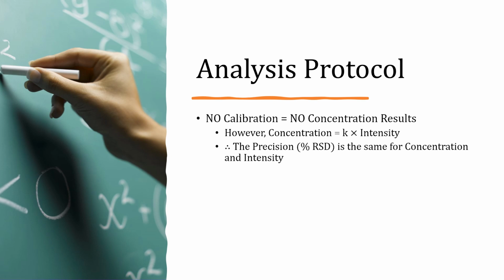So remember that there was no calibration and thus no concentration results. However, the concentration is always a constant multiplied by the intensity. Thus the precision for the concentration will be the exact same as that of the intensity.